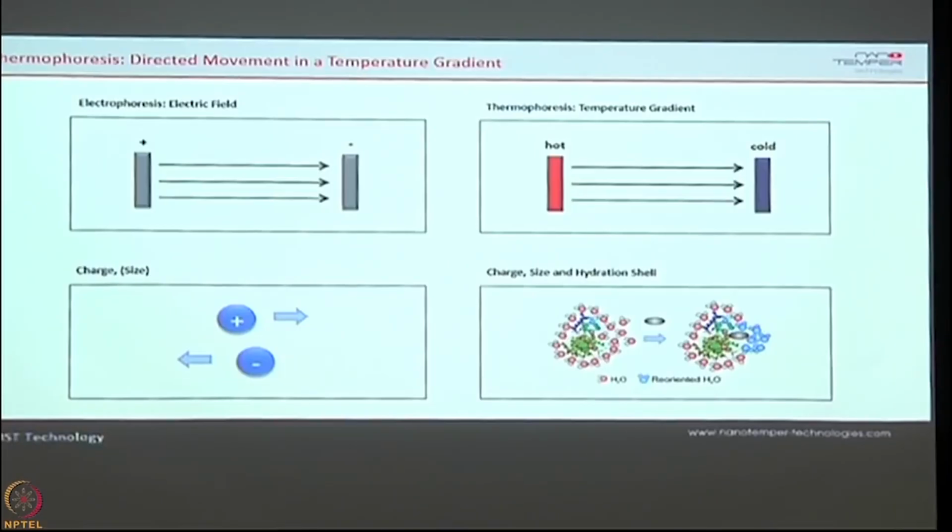Normally when a protein binds, the size changes. When a protein binds DNA, the charge changes. And when a protein binds a small molecule, the charge or size may not change, but still one water molecule is displaced upon the binding. So it all depends on how it is binding. So this technique has become very sensitive to all these three parameters, and there will be a change in the thermophoresis behavior when there is any change in these parameters.